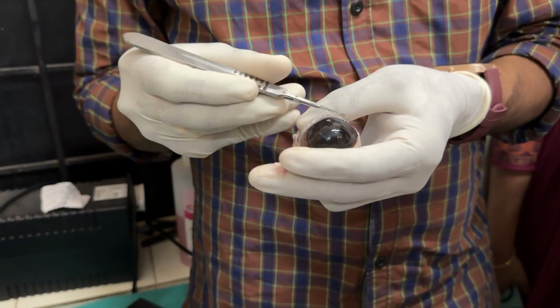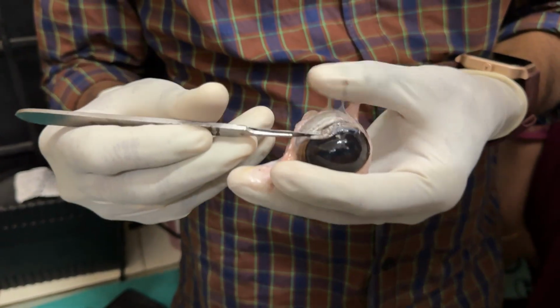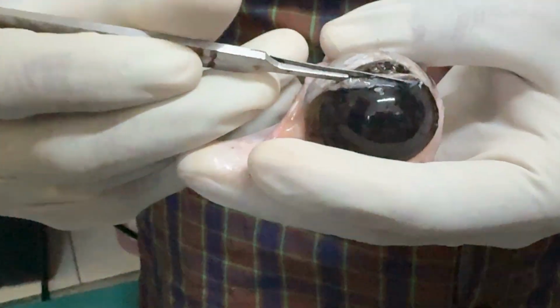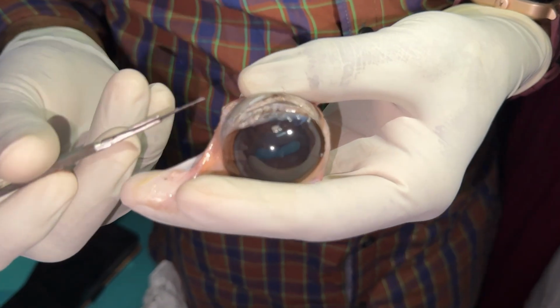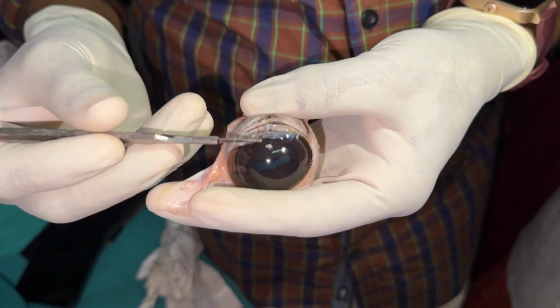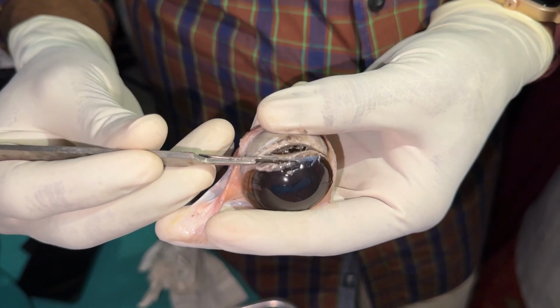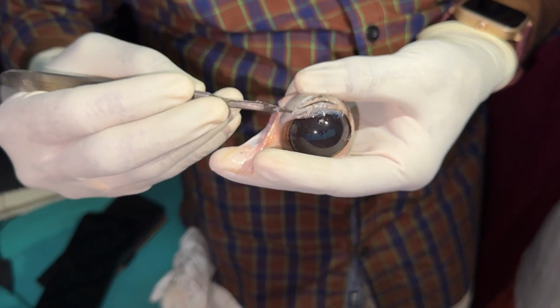Now we can see a brown structure behind. That is the iris muscle. These are the fibers of the iris. Somebody put a light. The cornea is transparent and colorless. It appears black only because of the iris color. You see that? I separated the cornea without injuring the iris.